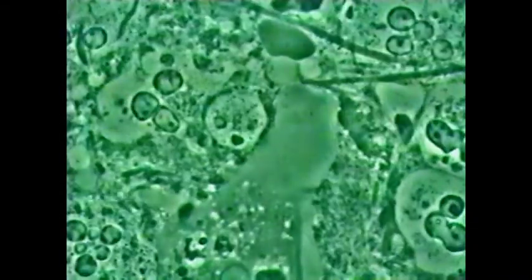Here we see the amoeba that has ingested a lot of material. Most of this ingested material is red cells, phagocytosis of the red cells, and phagocytosis of the nucleus of the neutrophil. Here again, it's pretty infected. This is what we can call clearly dysbiosis in periodontal disease. So this is dysbiosis and inflammation, uncontrolled inflammation.